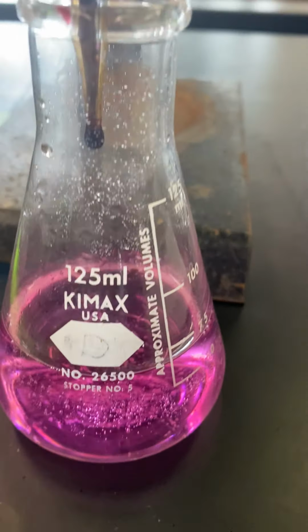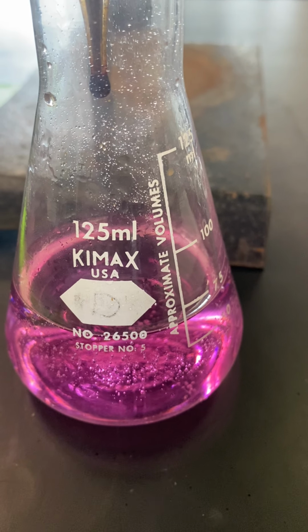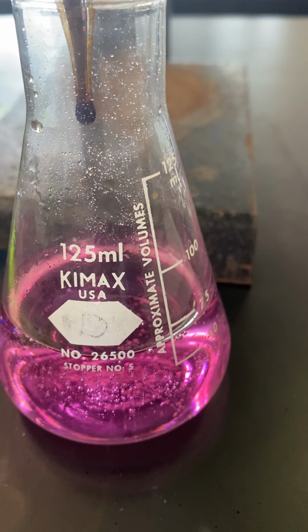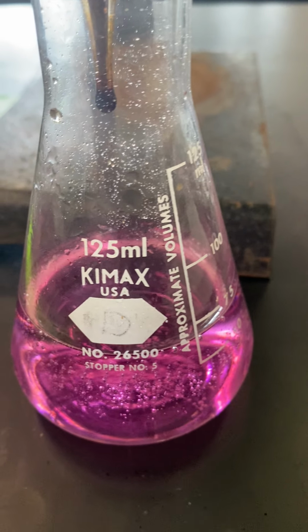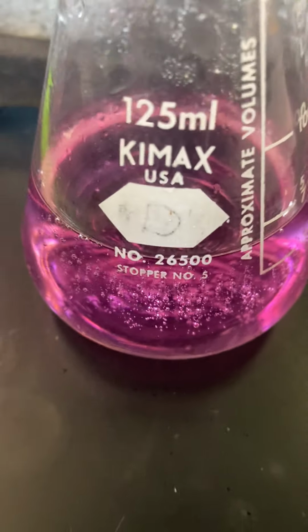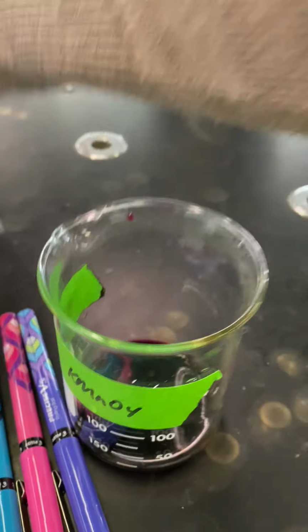You can see the purple color is persisting because we've consumed all of the hydrogen peroxide, which means that permanganate is hanging out in the solution. So I'm at my endpoint, which means I must record the volume on my burette.